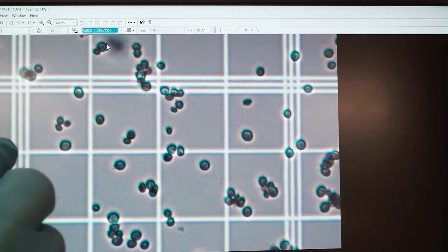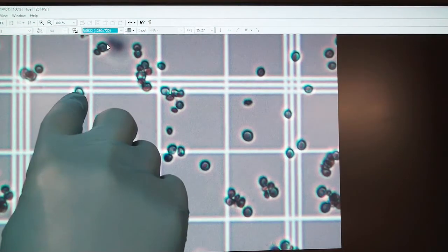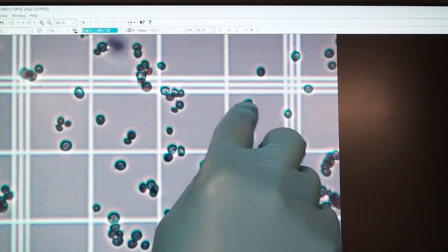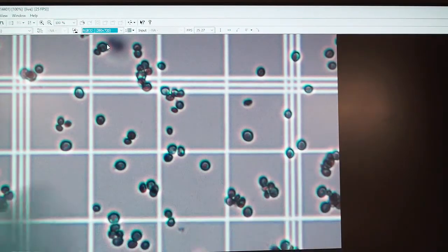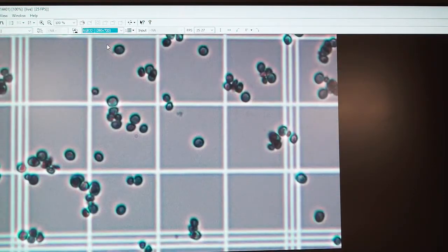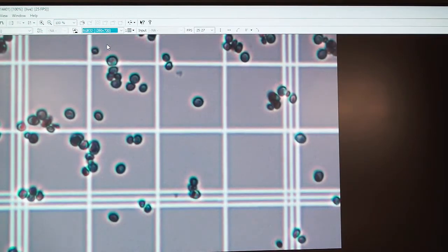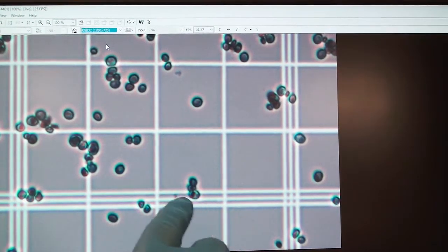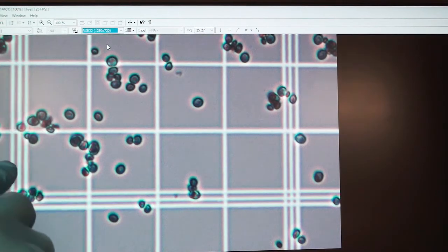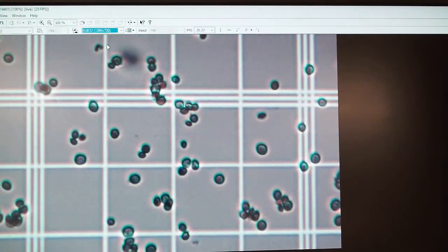I've gone to a higher magnification to do our actual counting. When I count, I want to be counting any cell that hits the top and the right-hand side boundary. Make sure you don't do extra counting — count the top and the right-hand side, but don't count the bottom and the left-hand side. If you change and do the left and the bottom, that's okay, just be consistent.